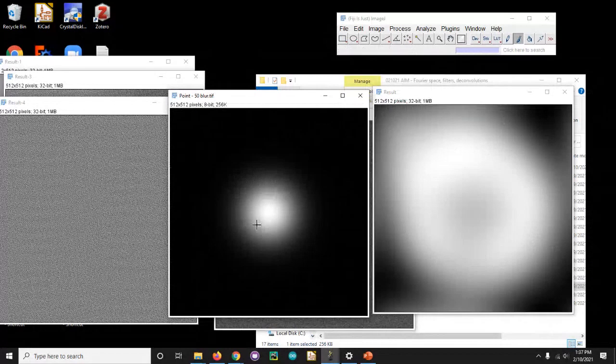And the third problem we're going to run into is, in this case, we know effectively our point spread function at impossibly high resolution. In this case, the equivalent microscope would be like we know it at single nanometer resolution. But the only way to know what your point spread function in your sample was is to measure it, or to guess, which is the iterative deconvolution. But the catch is, well, what are you going to measure it with?